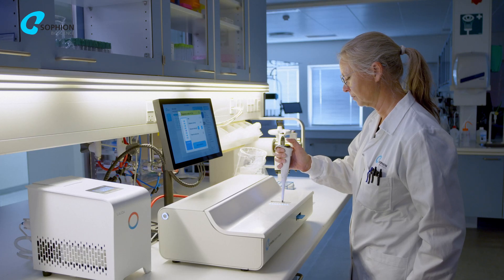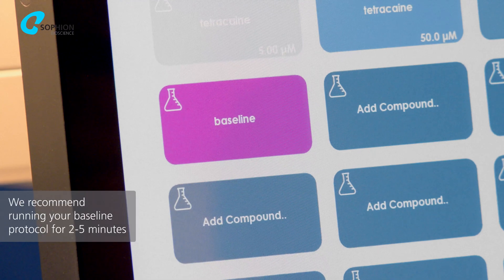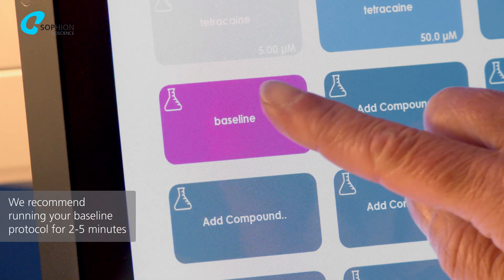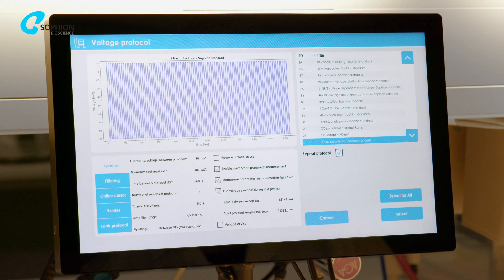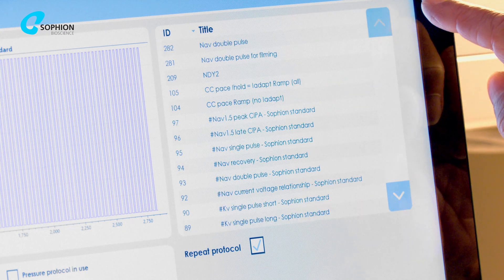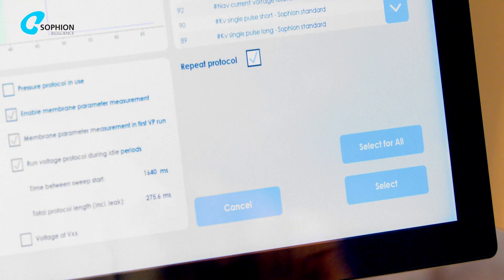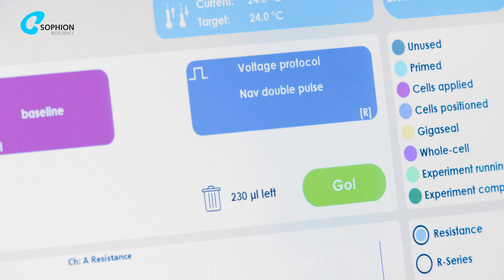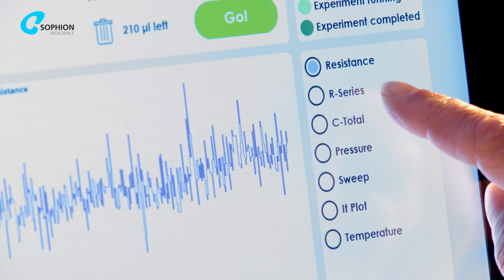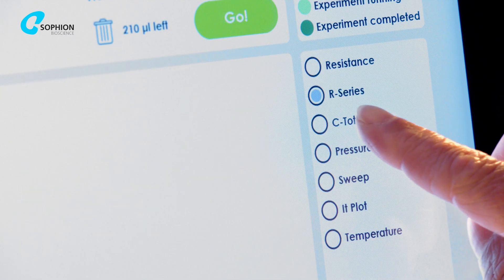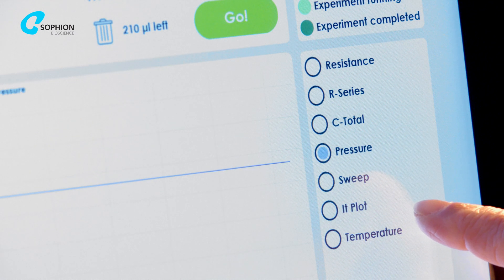To begin recording after whole-cell configuration, you need to establish a baseline. Select the baseline button you added to the compound map and a voltage protocol from the protocol list. Press the Go button, but do not add any liquid at this stage. You can watch the Live Sweep view and toggle between current and resistance signals to decide when to start your experiment.